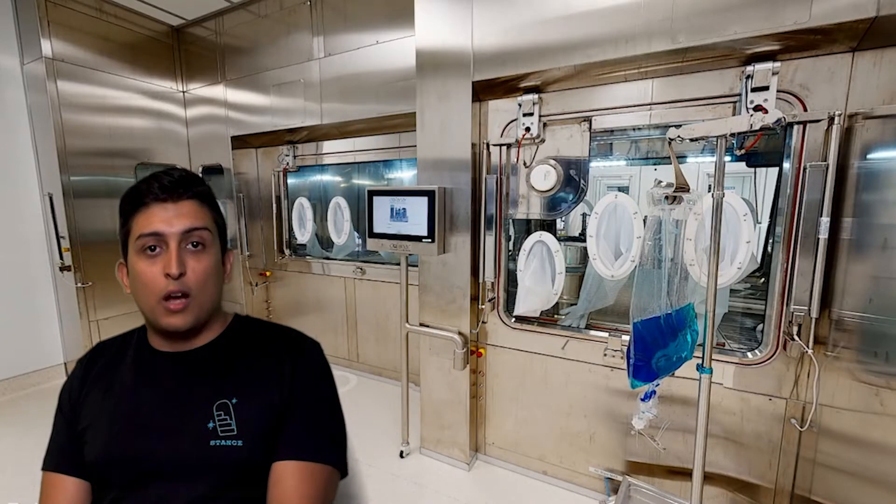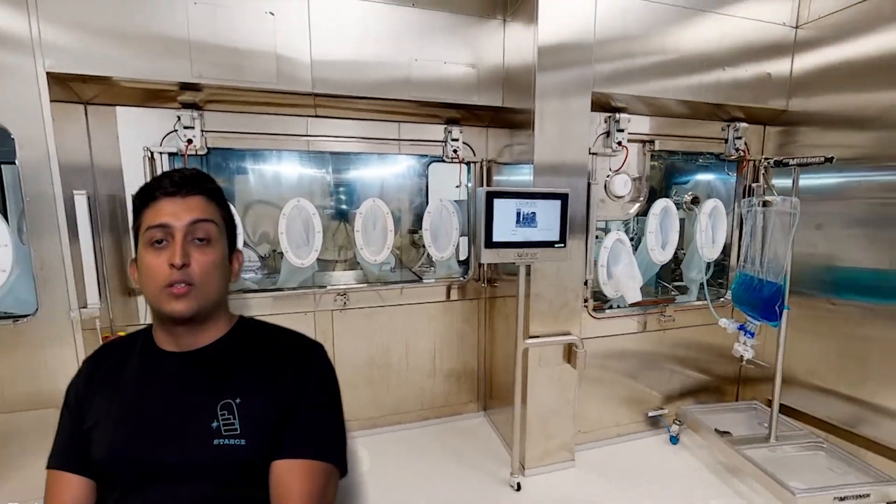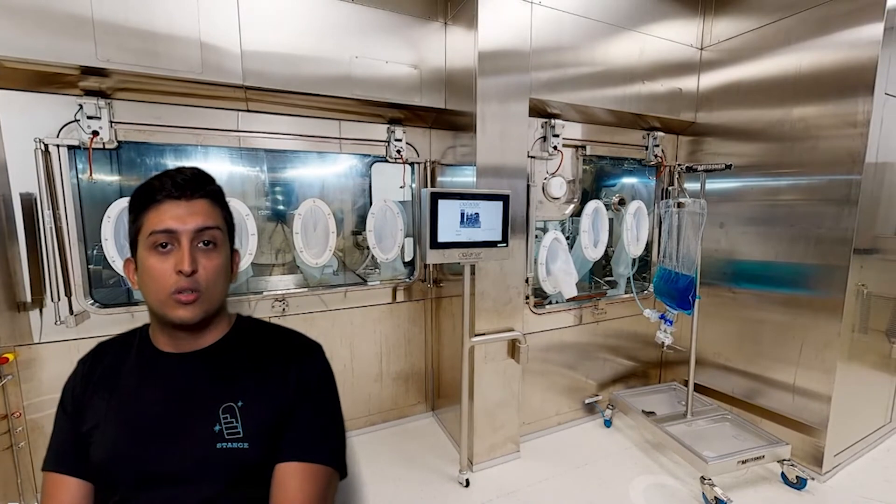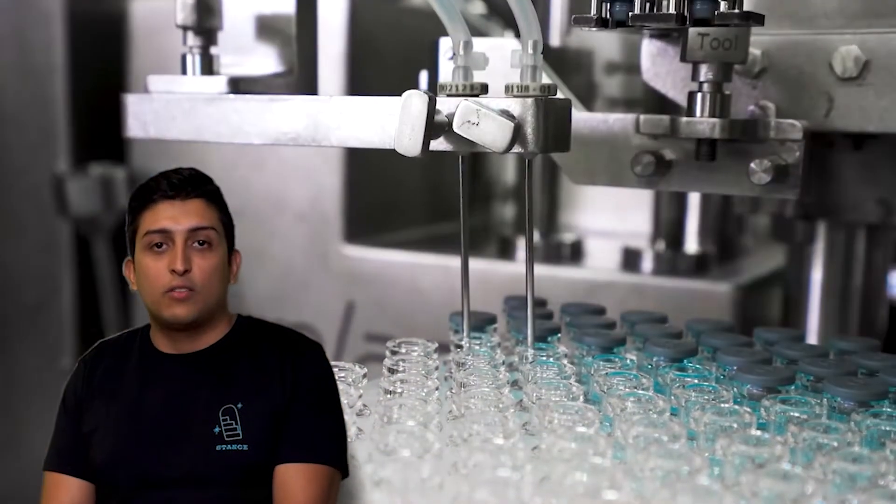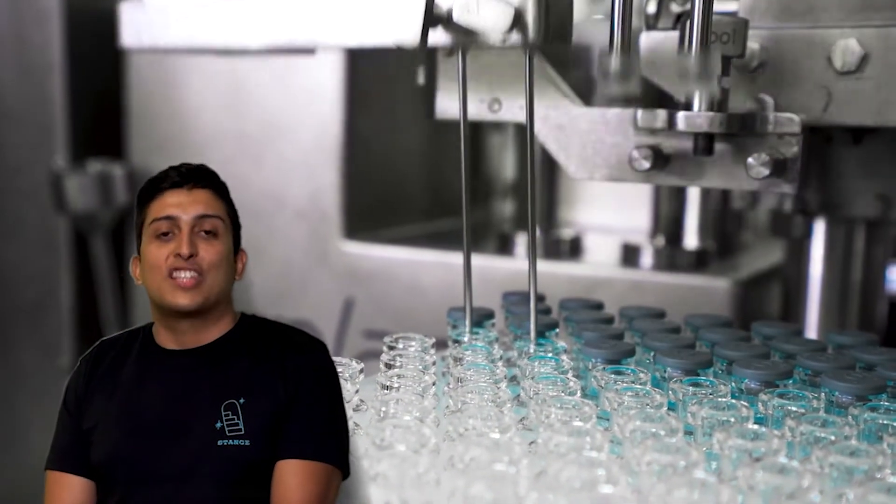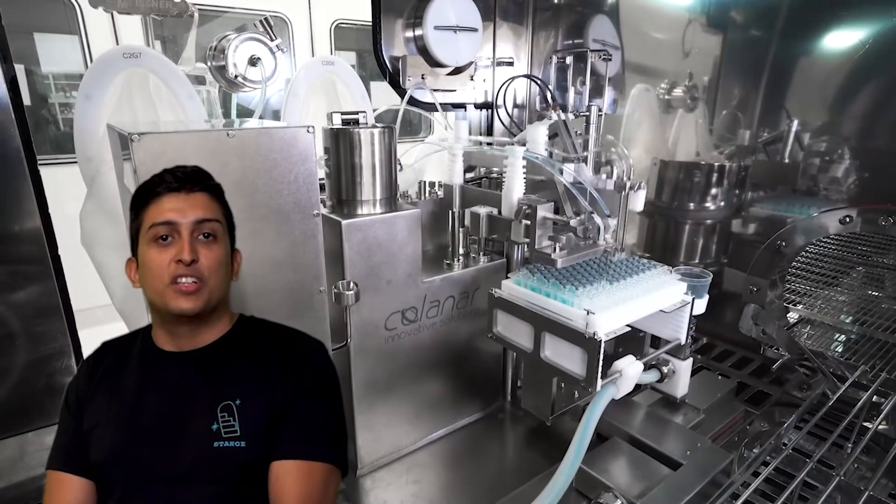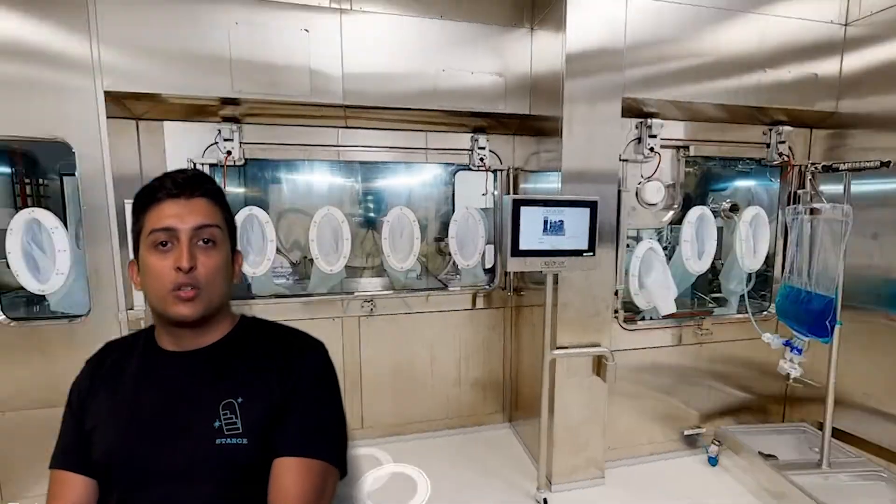Hi, I'm Ishan Jaisal. I'm a supervisor of the filling group at BSM, and I've been at BSM for close to a year. What you're looking at right now is our semi-automated filling line. This is where we have filled hundreds of thousands of vials, syringes, and cartridges with sterile medications for a variety of diseases. This line has been in operation since 2018. If you watch the screen, I'll take you around to the other side of the filling line.